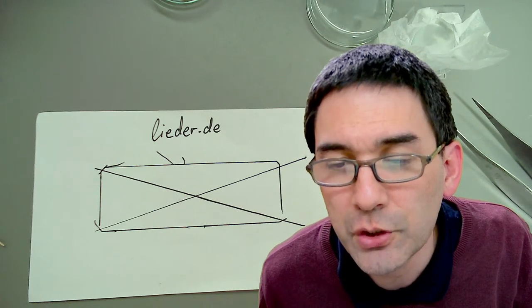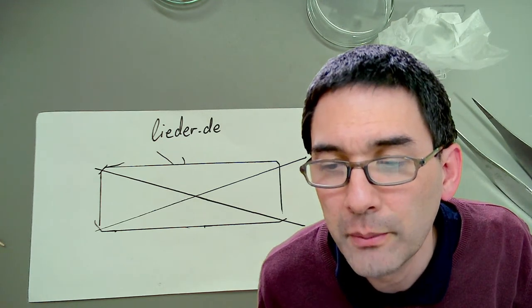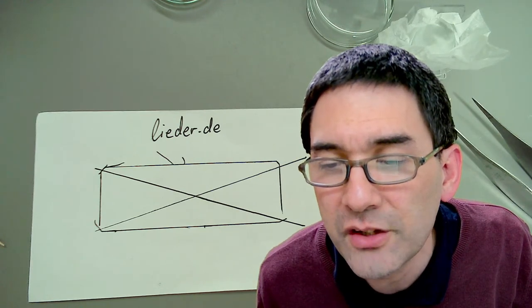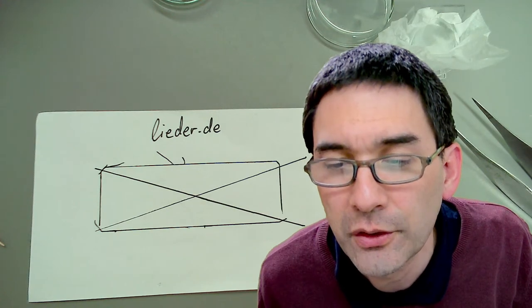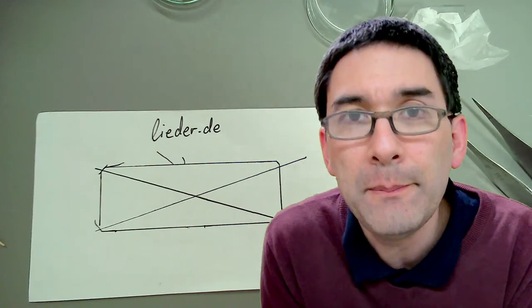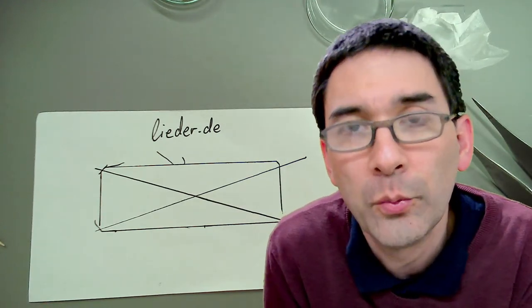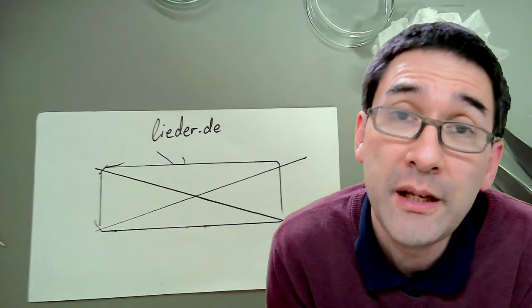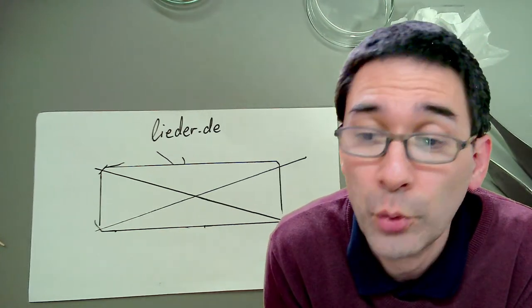Keep your eyes peeled. I'm just going to go quick here. I've made some semi-permanent slides with pollen grains and glycerin with fuchsin. After a few weeks, the pollen grains change shape from elliptical to spherical. They change shape depending on whether they absorb water or not, so I assume that in nature they also change their shape based on how much moisture there is.